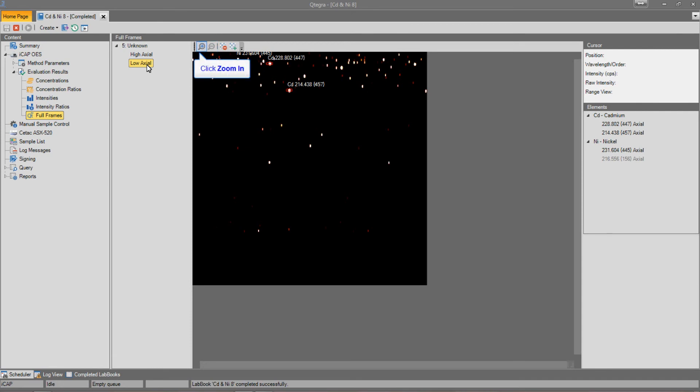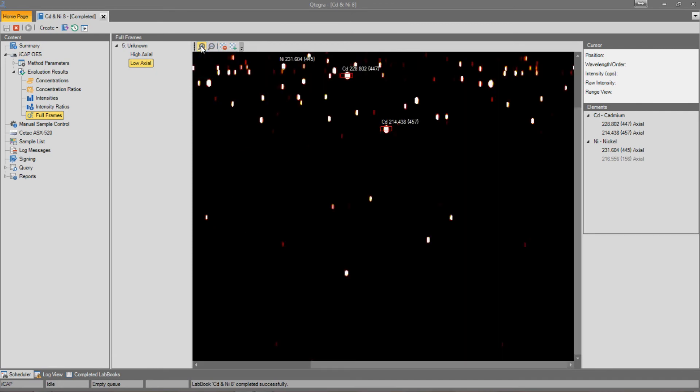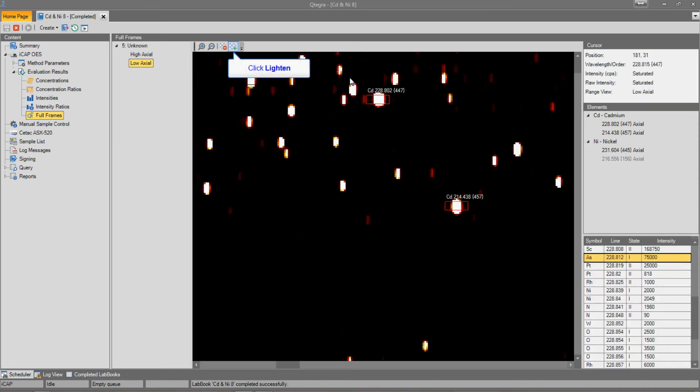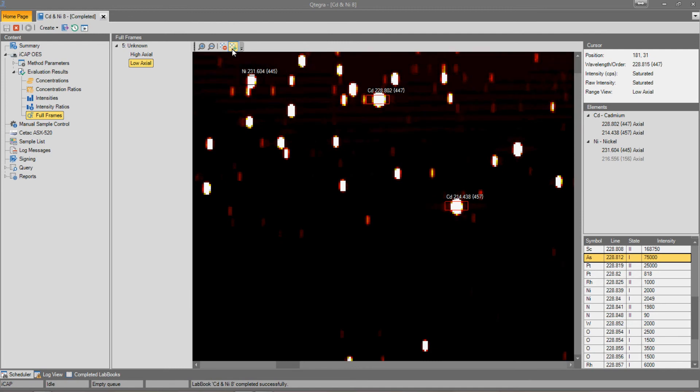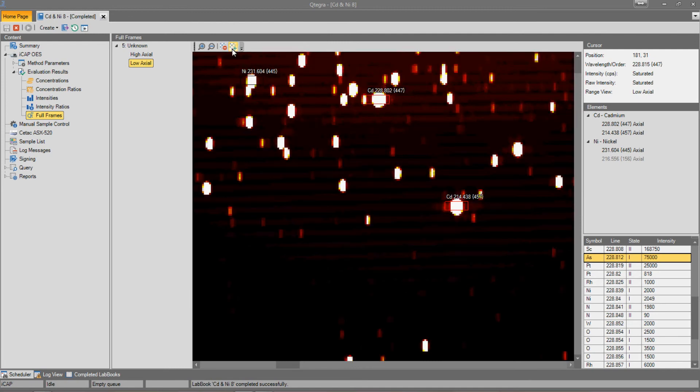We can control the magnification of the image by using the zoom in and zoom out buttons. Or alternatively, by double-clicking on a location, we can zoom into that area. We can use the lighten or darken buttons to adjust the brightness of the image.